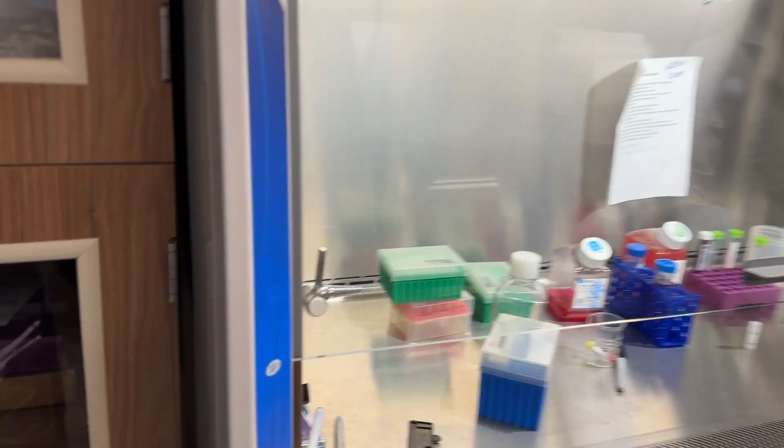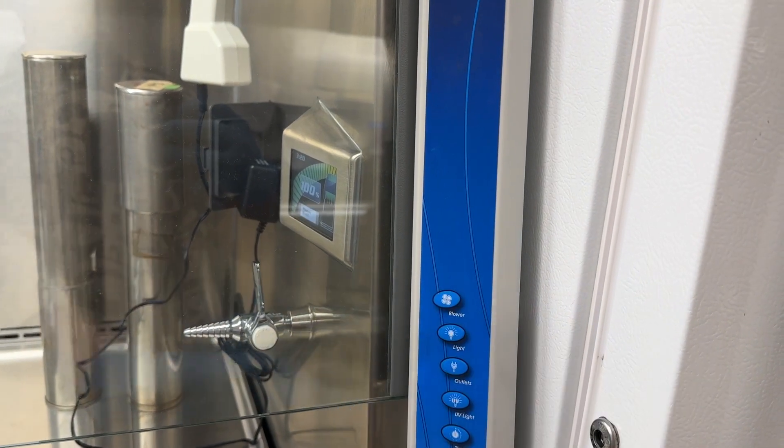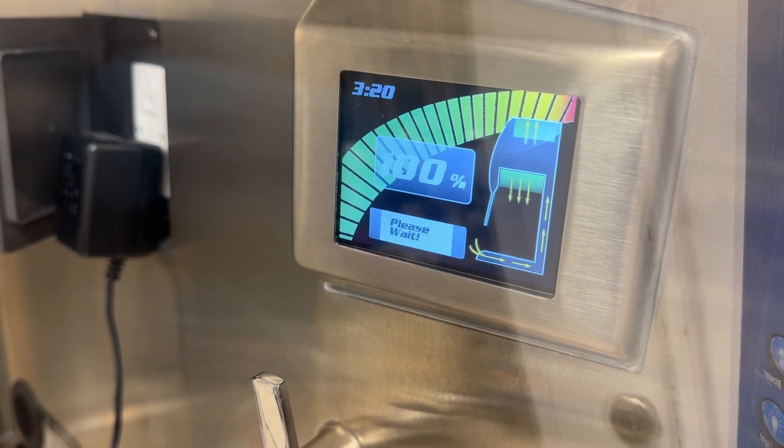Here's Spencer — this is how we get our biosafety cabinet prepped. Open that sash, make sure it gets up to sash height. If it is too high or too low, we don't have proper airflow. Then hit the blower button; the readout will say 'please wait,' and at that point we wait.